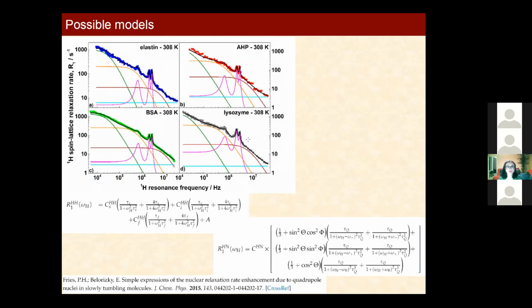The problem of quadrupole peaks is just a separate subject. I will see whether there is a chance that I could talk a little bit about that. However, the trick is that the first one appears at a frequency which corresponds to the difference between those two ones. And what does it include?